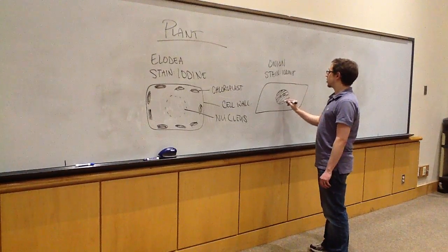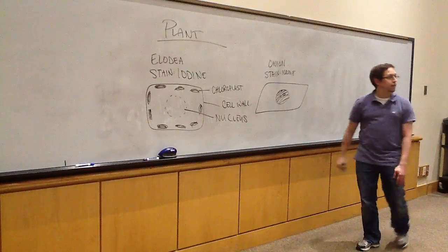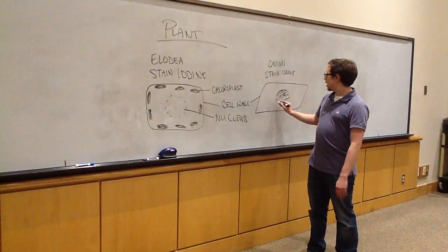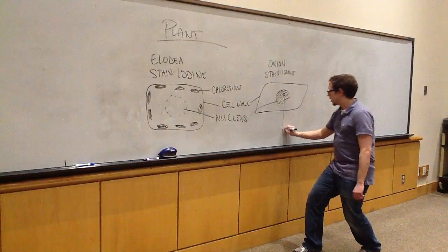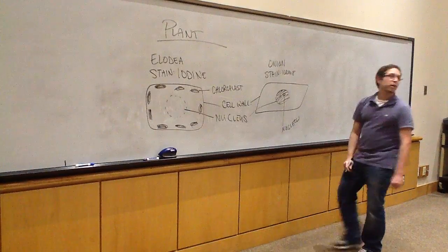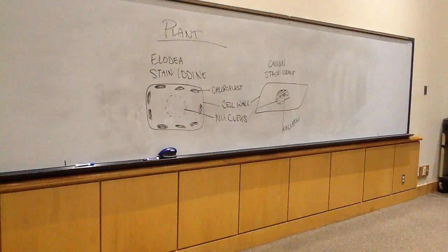And inside that structure, you might have seen a couple of different circles. Now again, these are plant cells, so what's my outermost structure called? The cell wall. Okay, and then that centralized structure there, the nucleus again. And then these circles, in theory, are nucleoli, or the nucleolus, which is the primary manufacturer in the nucleus of ribosomal RNA.